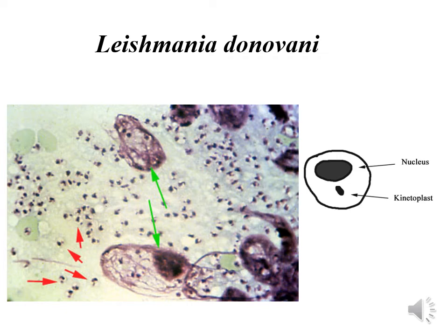In this parasite, if you look at the diagram to your right, it shows the nucleus and kinetoplast. The parasite is somewhat oval or rounded in structure, and there is no free flagellum. That's why it is known as an amastigote, or generally we say LD bodies: L for Leishmania and D for donovani. All of those small structures have the same oval or somewhat rounded structure, with no free flagellum.